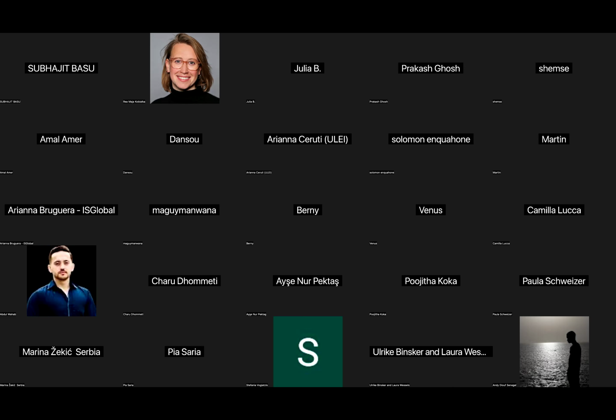There's other online software that you might know that do that as well. For RPA primers, there's no such software, so you have to design them on your own based on the basic RPA characteristics a primer needs. You still have to look for them on your own based on the sequence. So there's not, let's say, a ready-to-use RPA primer design click on Geneious, but you can still use it.